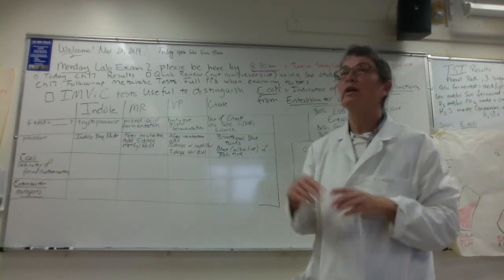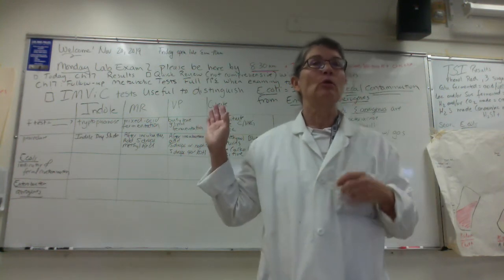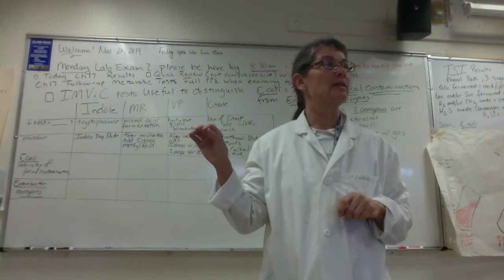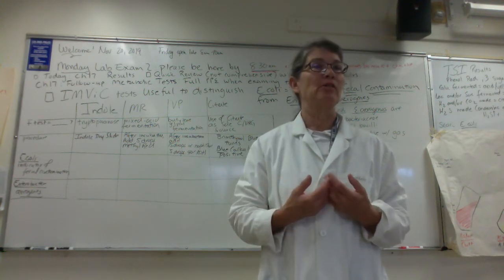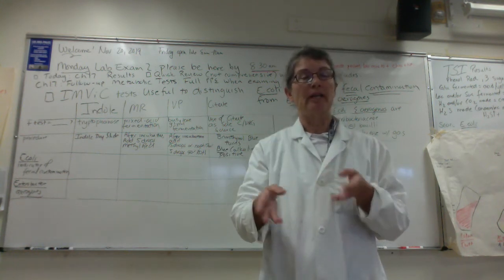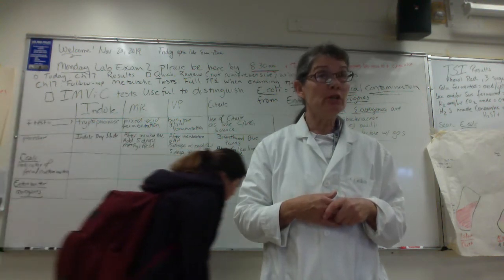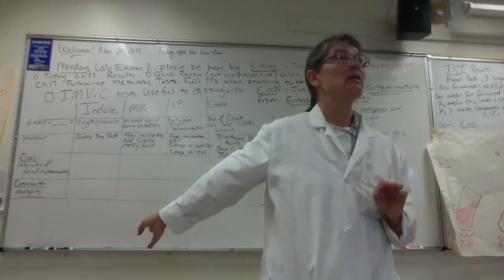So folks, what I'll do is break this up into little chunks with regard to the movies. We're first going to go over the IMViC tests. I'm going to tell you how to read them. One of them you have to add reagents to. So I'll go over kind of like the background, and then we'll break and let you guys read your tests. And then as a class, we're going to put the class results up here.